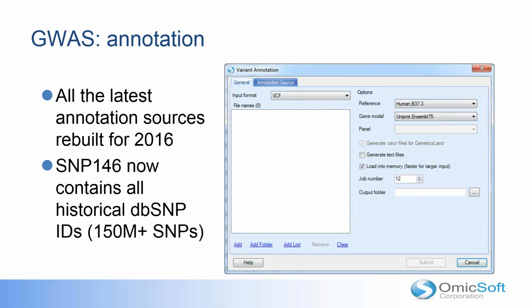After the annotation was generated, you still get a single report, even though the markers are chunked to do the parallel analysis. The eventual output of the previous module is still a single report. We understand it could be big, but it won't be bigger than things like dbSNP, where 150 million variants are found. So in practice, you may get 20 to 30 million variants in the association report. We ask users to provide annotation for all these variants and then filter from there.